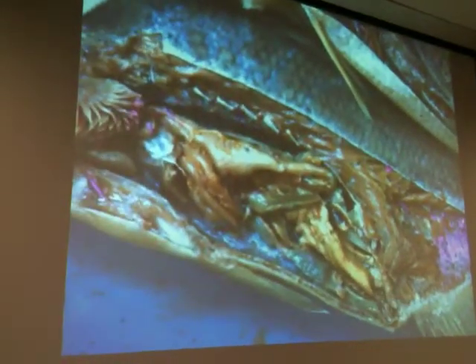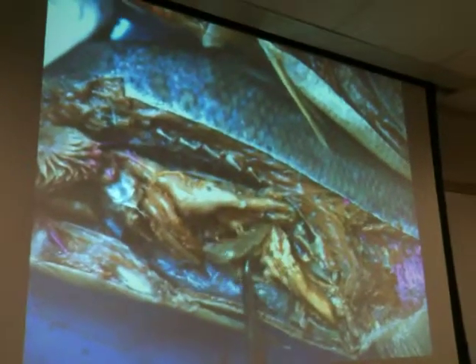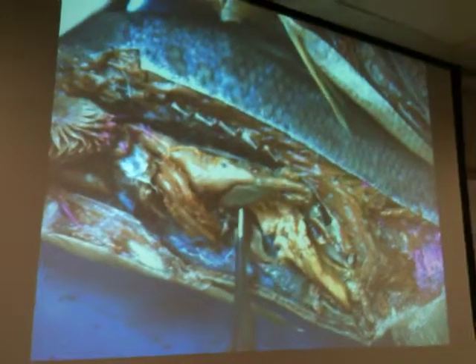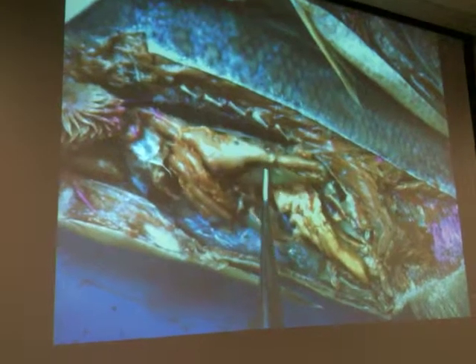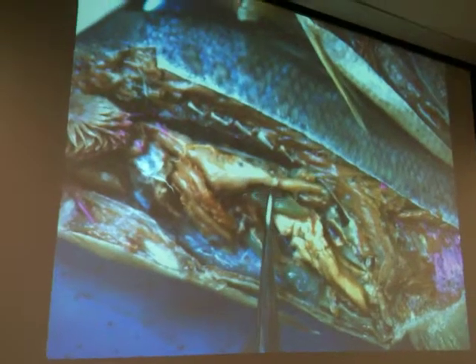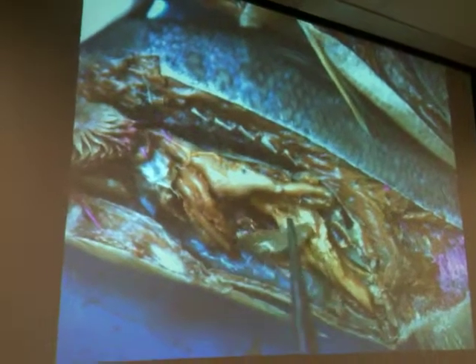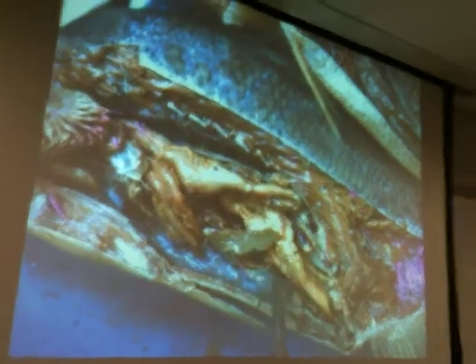So, also, you'll find a darker colored long organ. Okay, that's the spleen. All right. This one has been kind of dislocated, but it should be more ventrally located.